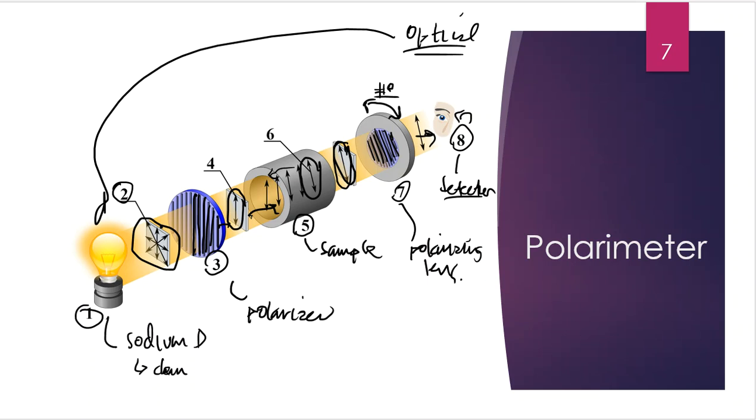So that's kind of the theory about what's going on inside of a typical standard polarimeter instrument as you begin to use them in the lab. So 2 lenses, one is somewhat stationary, one allows only one direction of light to come through, and that one direction of light begins to turn if it's optically active, and then out the other end it goes at a different angle than what it came in. So it's up to us or the instrument to turn that second lens left or right, and the magnitude of which we turn until we get the light to actually come through on the other side of the polarimeter too. And then we record our number. So on the rotating eyepiece, you're going to see some numbers or a meter, and depending on how far we turn, that's how we write down those values because they show up right there on the instrument.